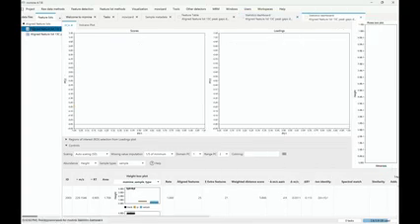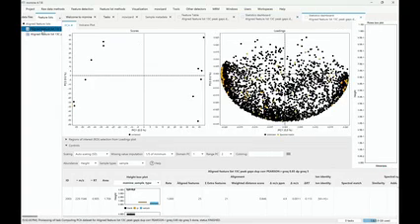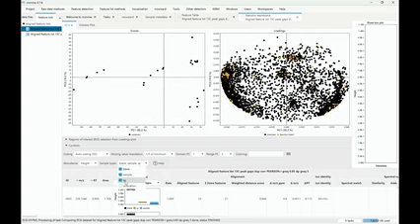I hit enter. I have to select, of course, the feature list that I want to look at. And then in here, you're going to see that on the one side, we have the scores plots with the samples actually mapping together. We can also add the sample type. Sample type here was actually picked up automatically because in the file names, the files are actually named underscore QC, underscore media, or underscore blank. And then we pick up that those are actually blank or QC samples. Everything else is first labeled as sample.